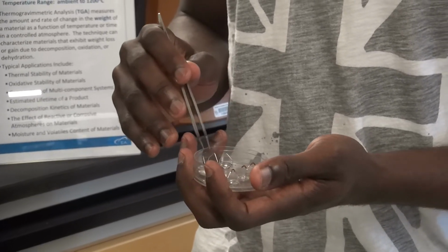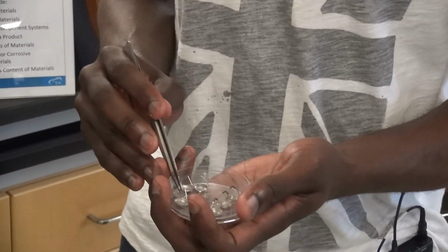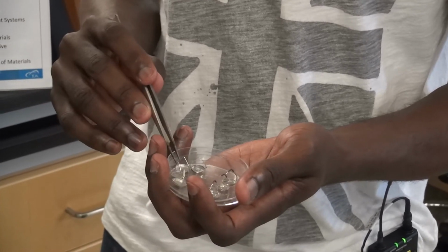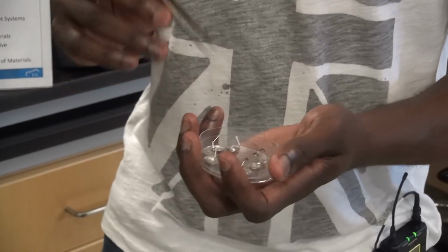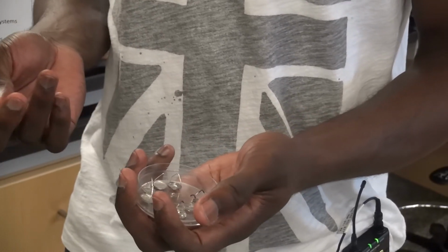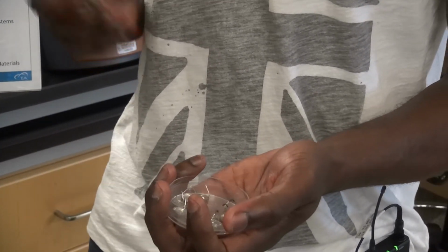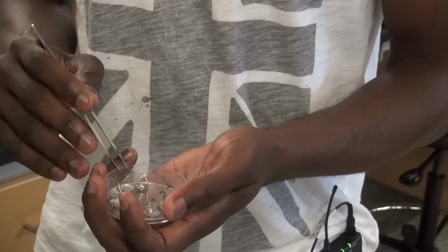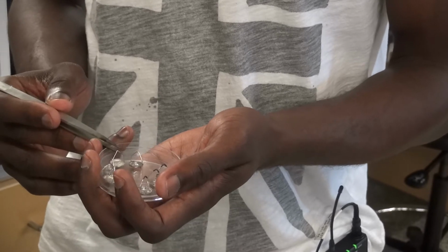So right now, we have 2 subcategories of pans. These are all platinum, okay? But there are 2 subcategories. So the ones that I defined are all platinum, so they're all silver looking. These are just pure platinum pans, and these have a temperature rating of 700 Celsius. Okay, so when you go into the software, like I will show you later, you actually have to tell it what type of pan you're using. So these pans are simply called the platinum 100 microliter pans. Okay.